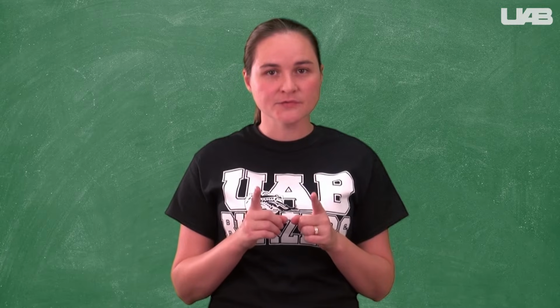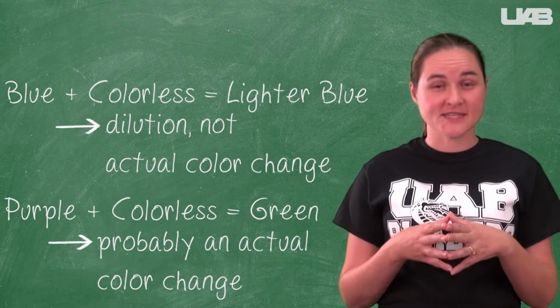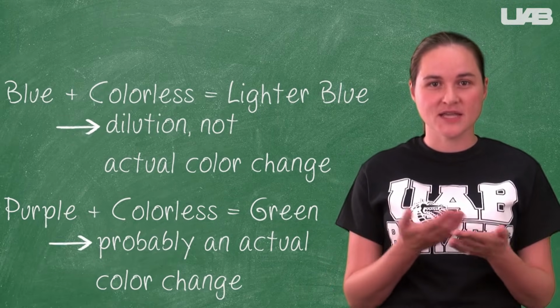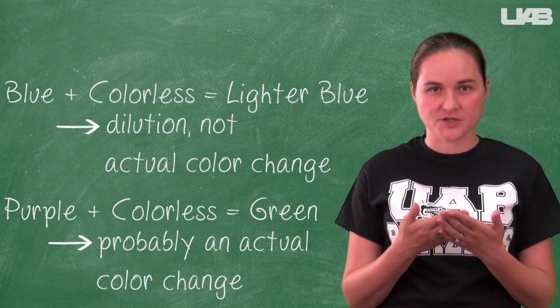However, be careful in identifying only actual color changes. For instance, if you had a blue solution and you mixed it with a clear colorless solution and it turned a lighter blue, this is probably a dilution effect versus an actual color change.